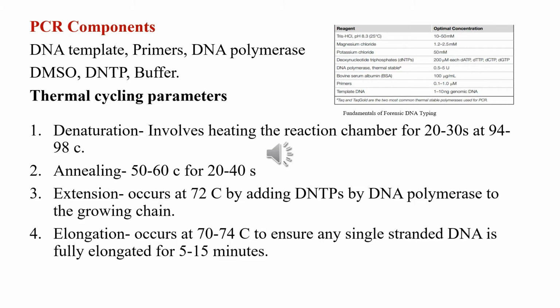dNTPs are the building blocks of nucleotides from which DNA polymerase synthesizes new strands. DNA polymerase aids in the addition of 4 different nucleotides to the reaction, that is adenine, thymine, guanine, and cytosine. Buffer provides the optimum activity of DNA polymerase by providing a suitable chemical environment.